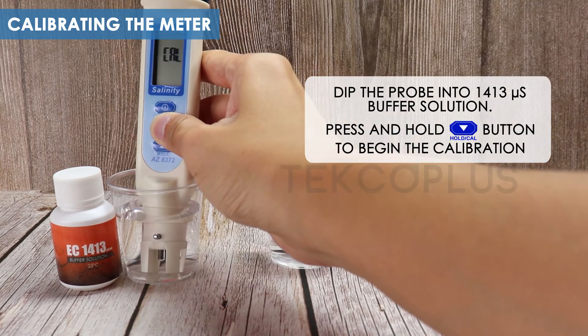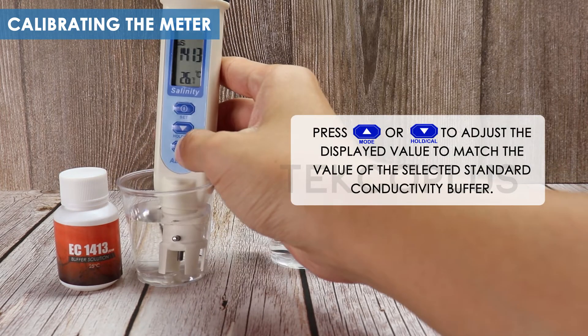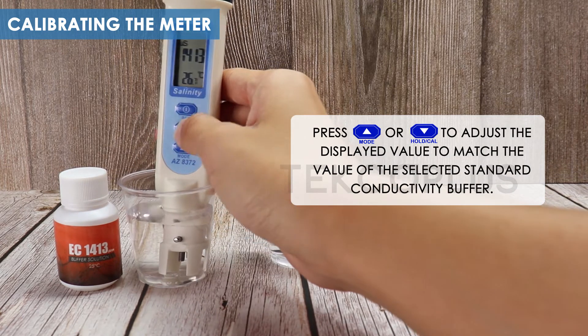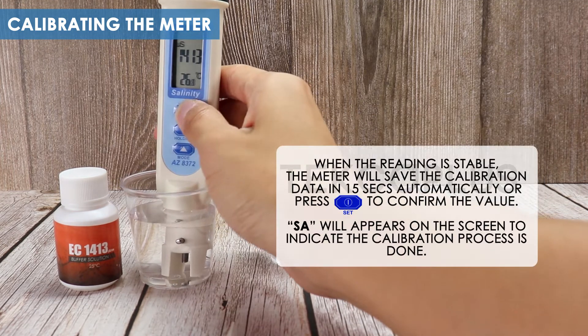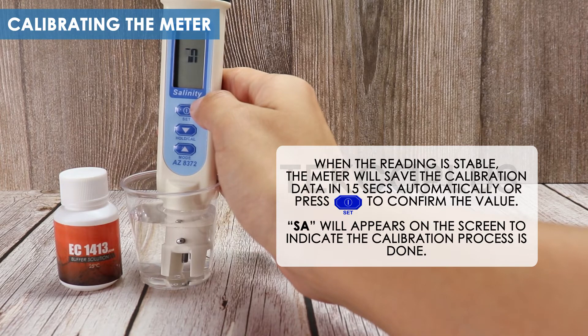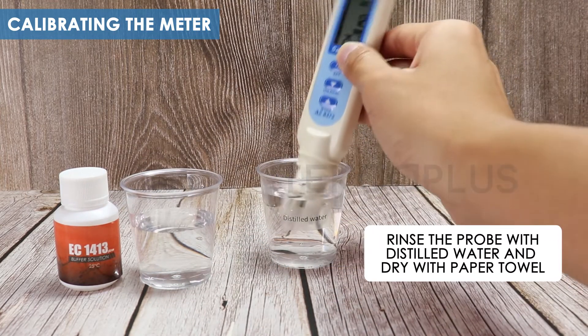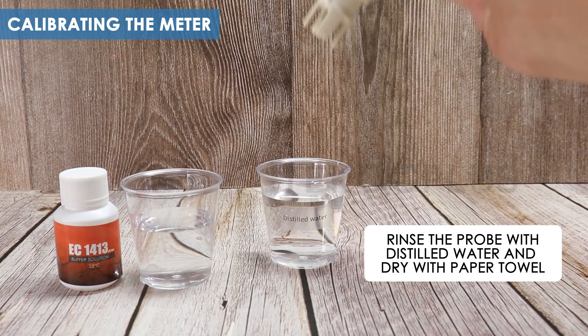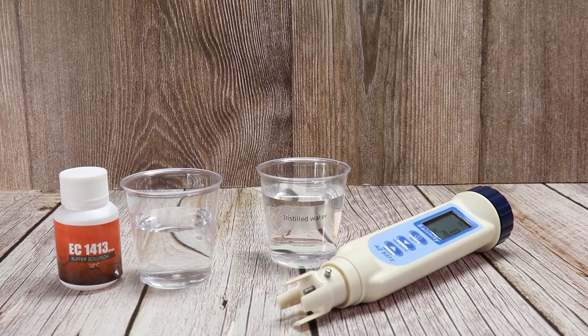Press and hold the HOLD/CAL button to begin the calibration. Press the MODE or HOLD/CAL button to adjust the displayed value to match the value of the selected buffer solution. Press the SET button to confirm the value. A confirmation message will appear on the screen to indicate the calibration is done. Rinse the probe with distilled water and dry with a paper towel. Press the SET button to finish.